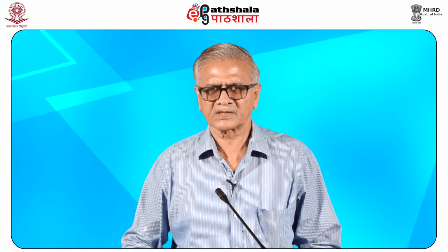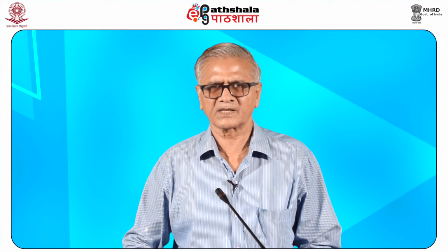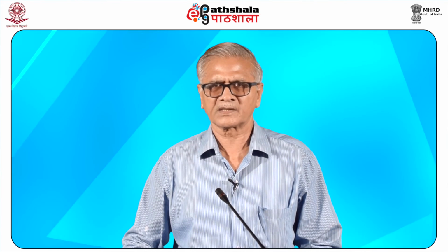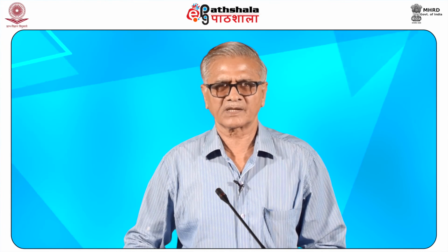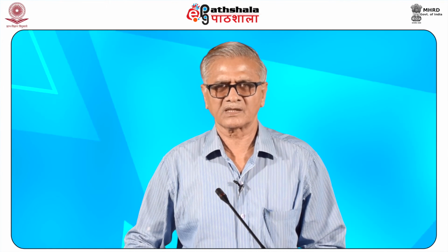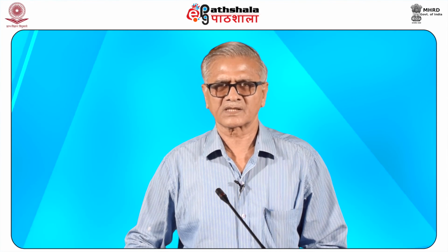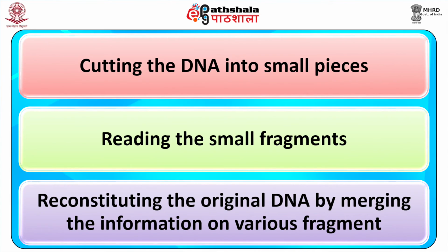Sequence assembly refers to the reconstruction of a DNA sequence by aligning and merging small DNA fragments. It is an integral part of modern DNA sequencing. Since presently available DNA sequencing technologies are ill suited for reading long sequences, large pieces of DNA such as genomes are often sequenced by cutting the DNA into small pieces, reading the small fragments, and reconstituting the original DNA by merging the information on various fragments.